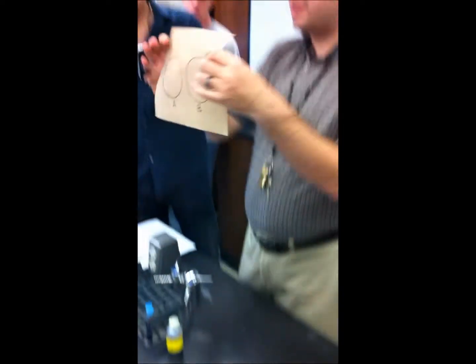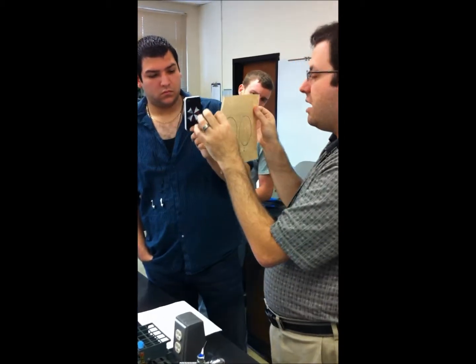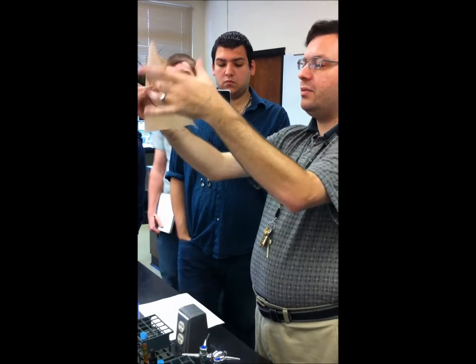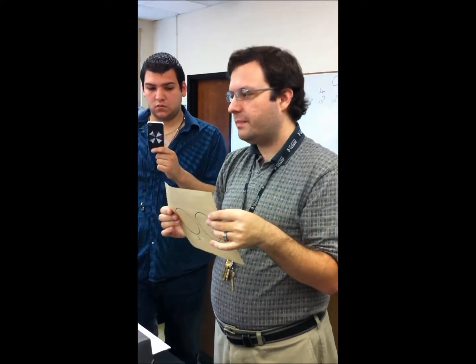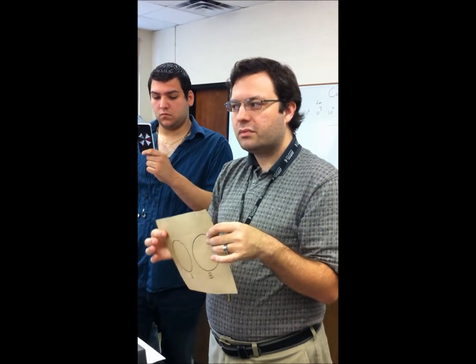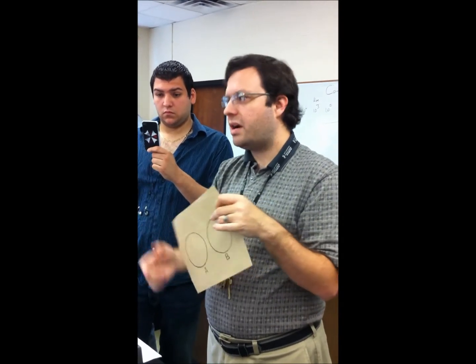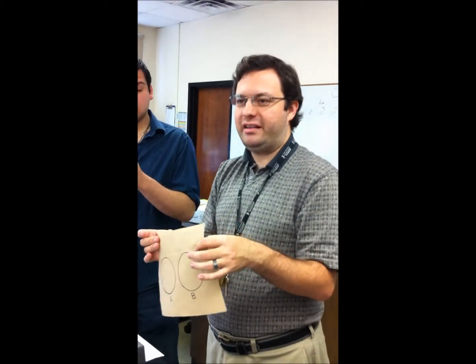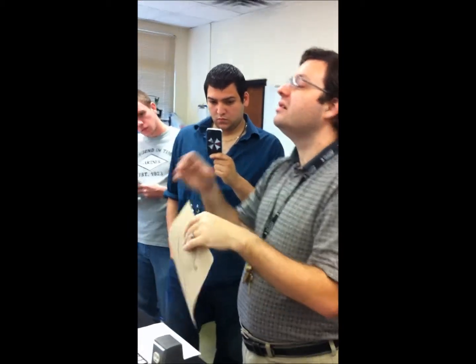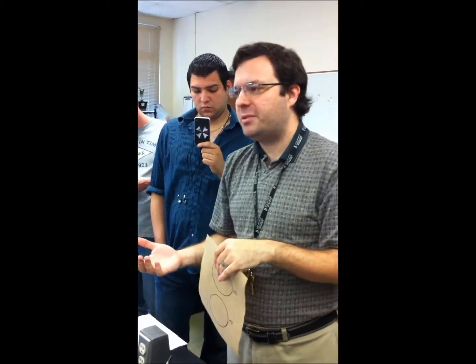So, the last test is for lipids, and they will literally take a piece of paper exactly like this. They will do the two tests. Which one's a positive? The one that doesn't dissolve. Correct. Well, it does dissolve into the paper. Right, it's the one that doesn't evaporate. Okay? So if it's evaporated and there's nothing there, then that's probably a negative test for lipids.